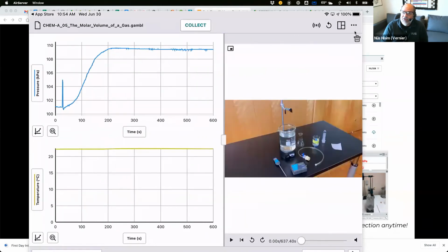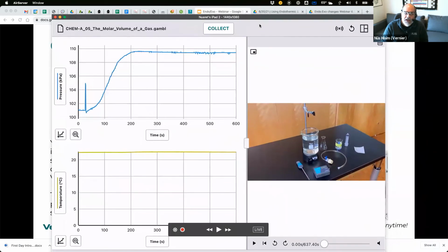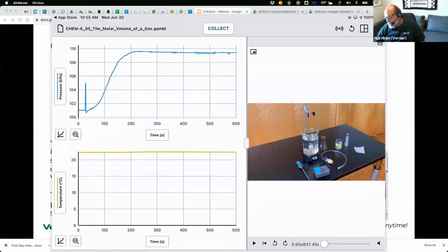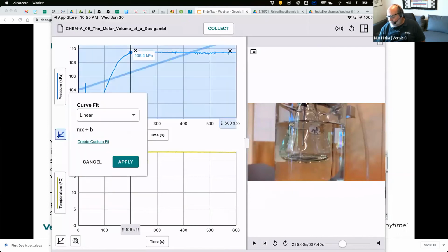Now, the other thing that some people find interesting, when Melissa was telling me, you should mention custom calibrated columns. Pardon me, I said that wrong. Custom columns and formulas. When you want to fit a curve with Pro, you may notice that mine here says create a custom fit. I can put in my own function, which is not something you can do in the free version. So if you have some unusual set of data and you want to match a function for that and fit it, you can do that.